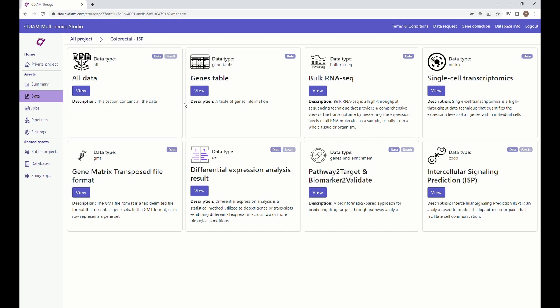Welcome to Pythia. This video will demonstrate the features for cell phone DB analysis.